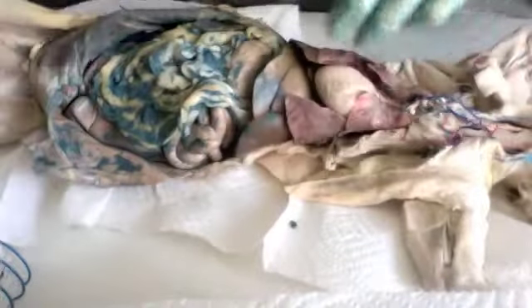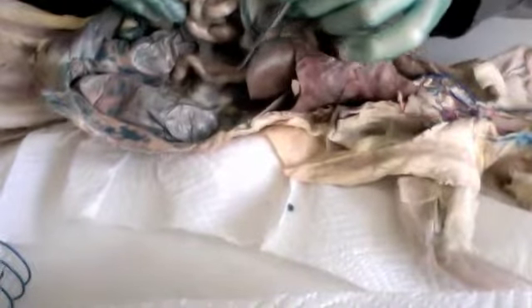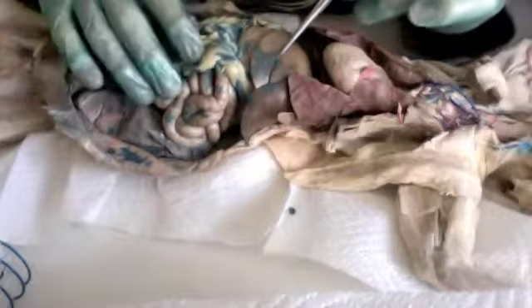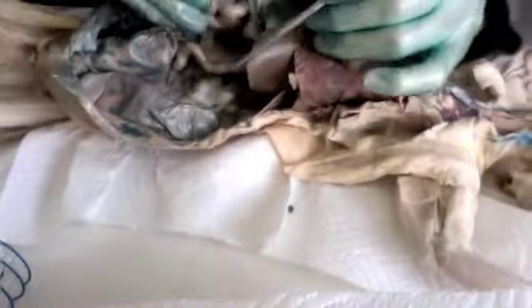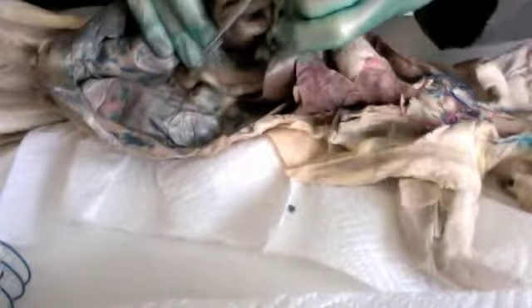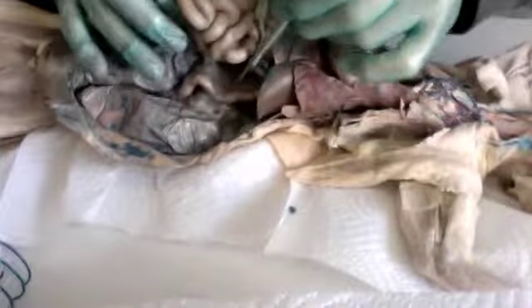Then we have the duodenum, or the small intestine. That is located here. Small intestine right here. Then we have the pancreas. And the pancreas is located here. The little sheet on it, that's the pancreas. Then we have the jejunum, which is located in this region.